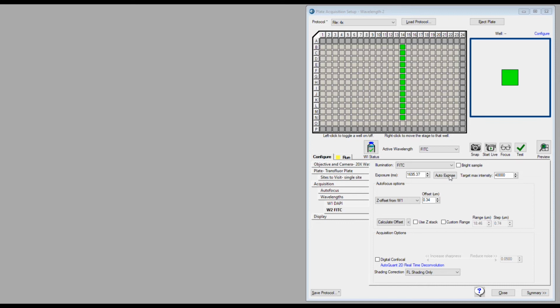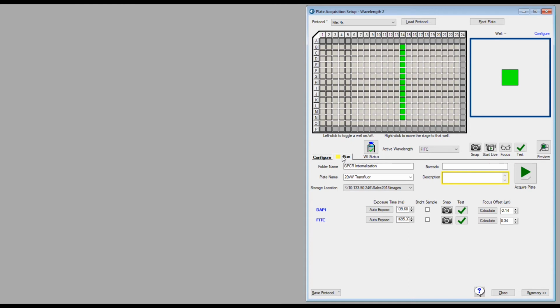Now that I'm done with this experiment, I can go ahead and head to the Run tab. Give the experiment a name and acquire my plate.